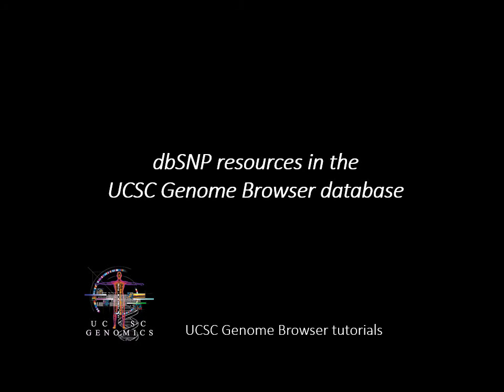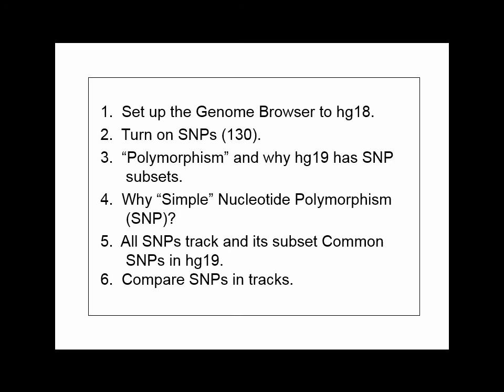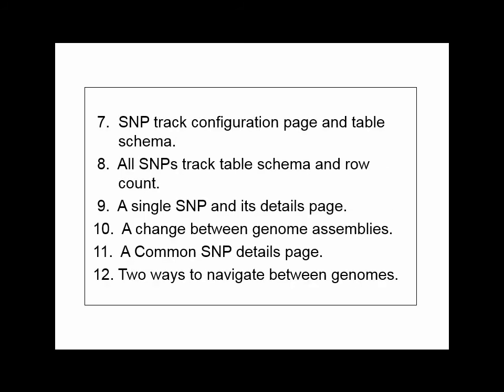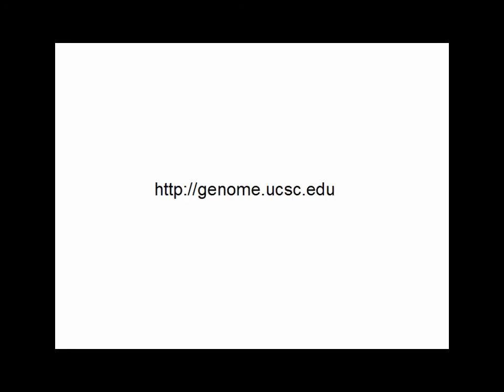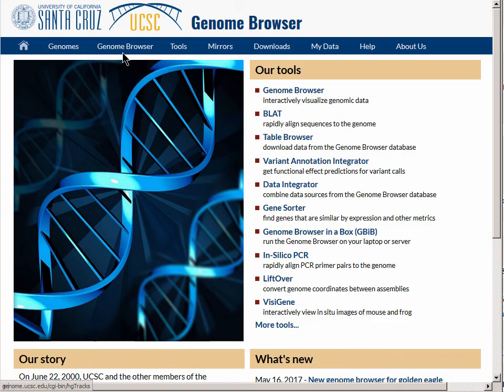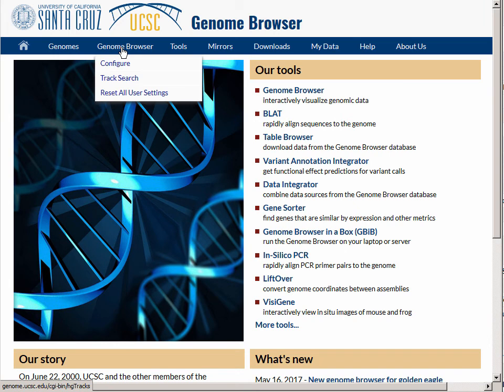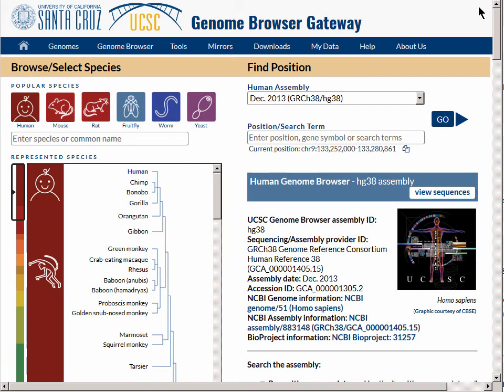Today we will discuss some of the variation data from dbSNP as displayed on the UCSC Genome Browser. We will start at genome.ucsc.edu at the main browser page and we will reset all user settings, which brings us to the most recent genome assembly, HG38.